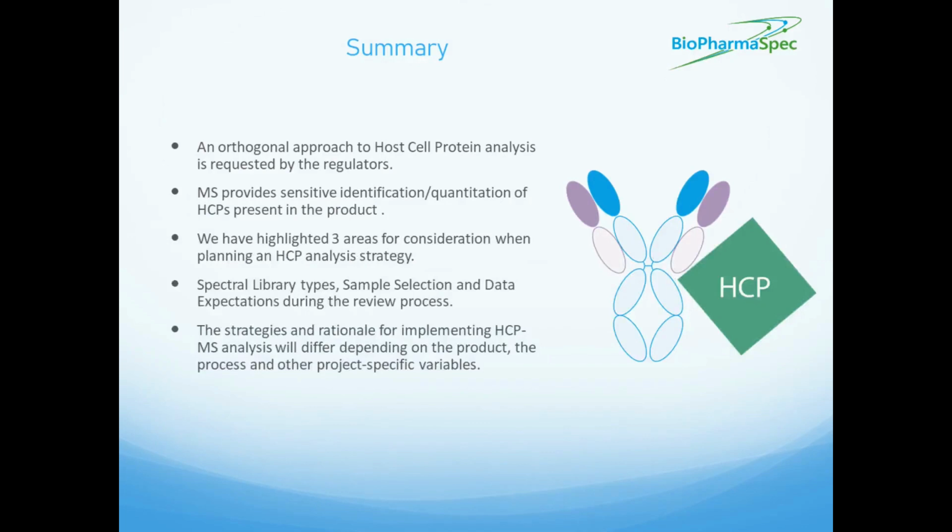So to review the main points, the regulators are interested in seeing evidence that can corroborate HCP ELISA results, and LCMS provides a complementary alternative that is accurate and sensitive with high reproducibility. It's not limited to HCPs that produce an immunogenic response or by manufacturing process constraints.